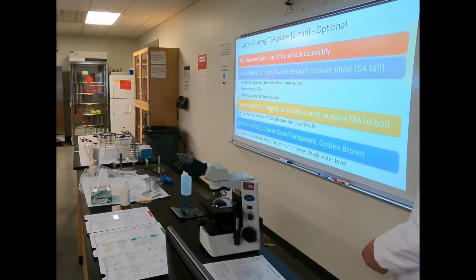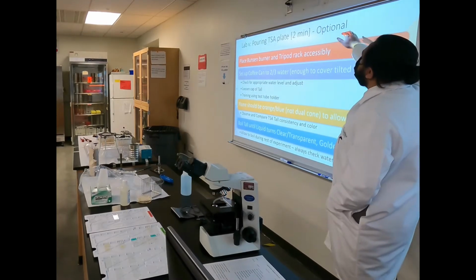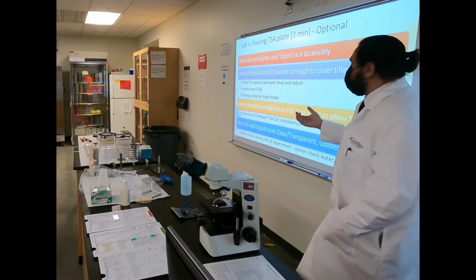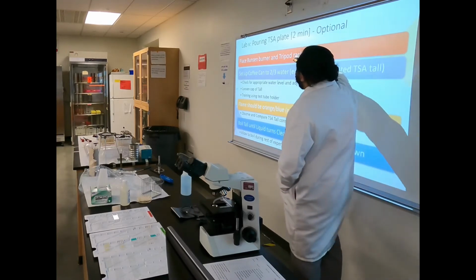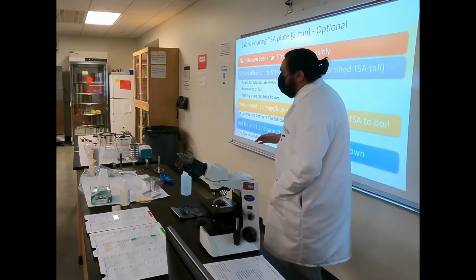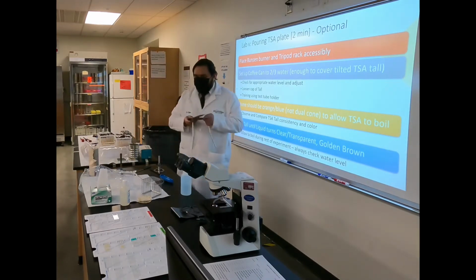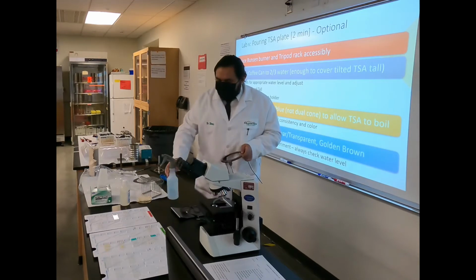All right, so now we're going to attempt to prepare our very first TSA plate that we can get to take home and lick it if you want to, right? But now we want to make sure we know how to set up our tripod, our gauze, and the actual Bunsen burner itself. First things, don't do this again.